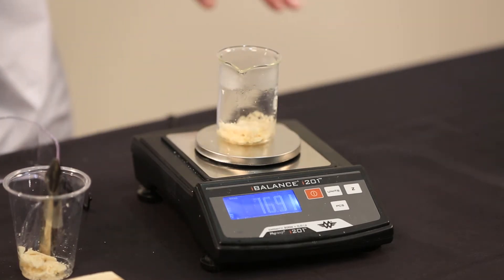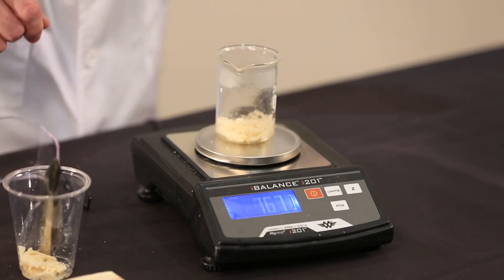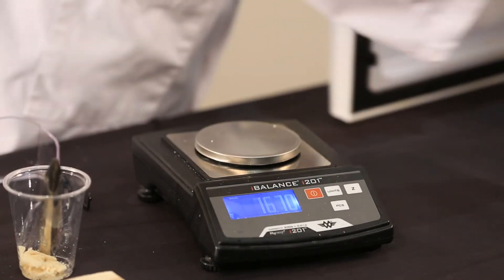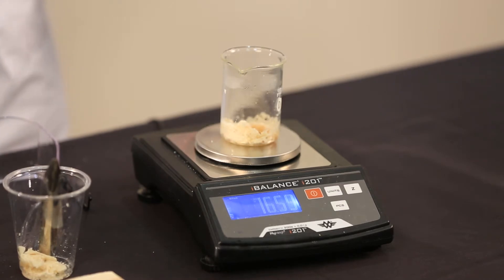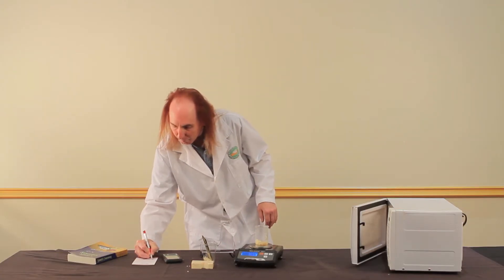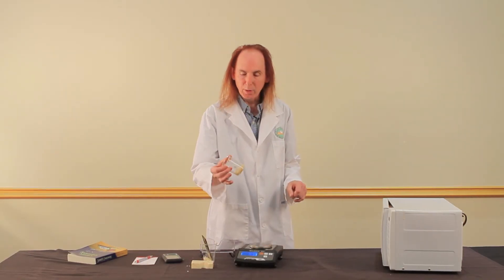76.91. 76.70. 76.60. 76.54. 76.54. I've got the same weight twice, which means I've driven all of the moisture out of the soap.